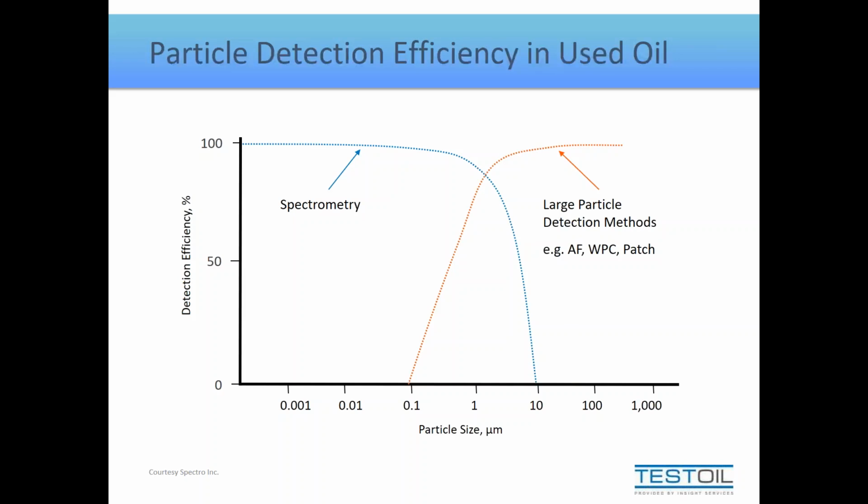So generally what is done is selecting a solvent that, when you do the dilution before the sample is introduced, helps negate these effects. And this is one of the reasons that we do apply an internal standard to that solvent to confirm the dilution is consistent. If the sample wants to separate readily from the diluent, you'll catch that on your internal standard. You'll know that it's not dissolving properly, and that may be partly because of the water interference.